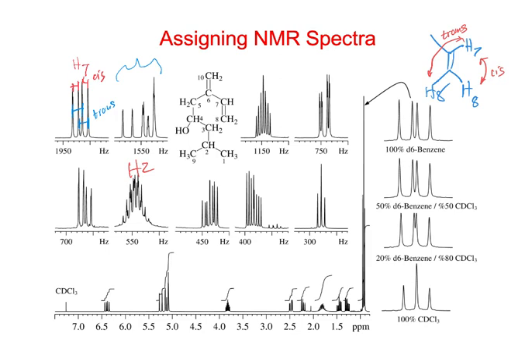Right. Or if you slide it over here, it doesn't really match, well, maybe. Might match something there, not to here. So probably this one then has the same coupling as that blue one, so this is an H8 that's trans, so that would be this one over here, right?